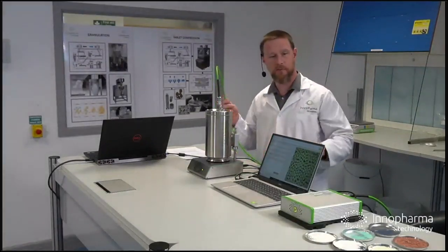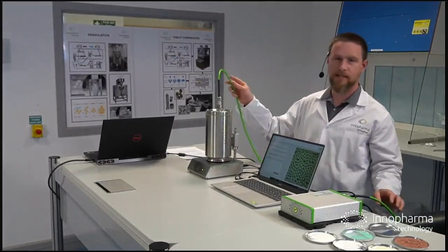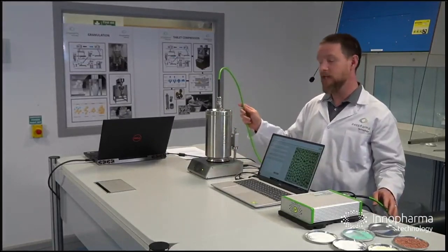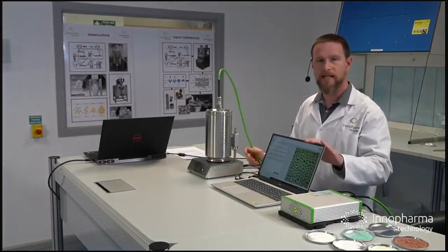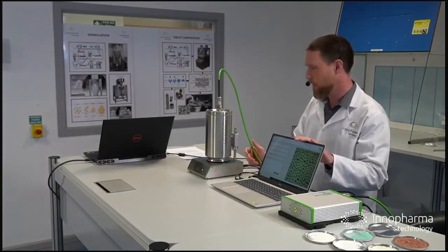Again, the green cable just runs over to this communications hub here. That's just taking the Ethernet and serial communication, converting it so it can go back to the laptop here, which is doing all the processing. This is doing the real-time analysis right here. Okay.